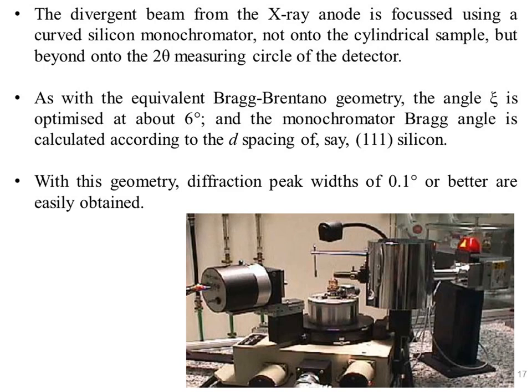An experimental setup for this geometry is illustrated in the photograph. The horizontal X-ray tube is visible far right, and a small PXRD detector is seen on the far left. The chrome shielding of the monochromator housing dominates the center right of the picture.